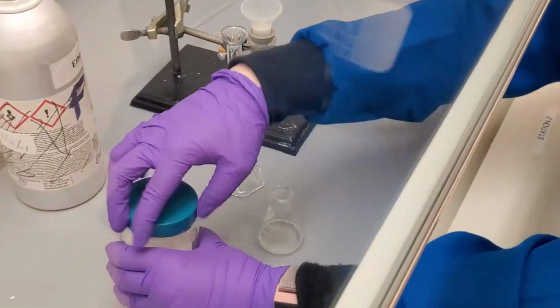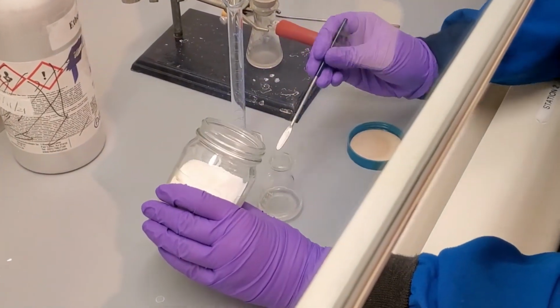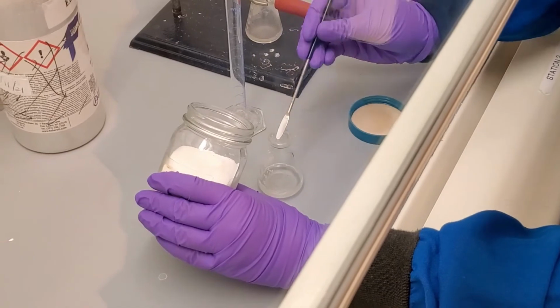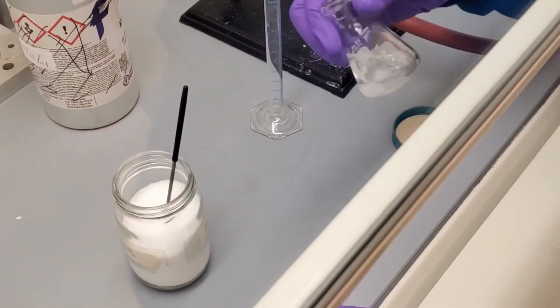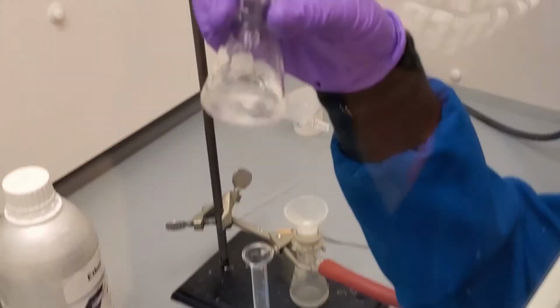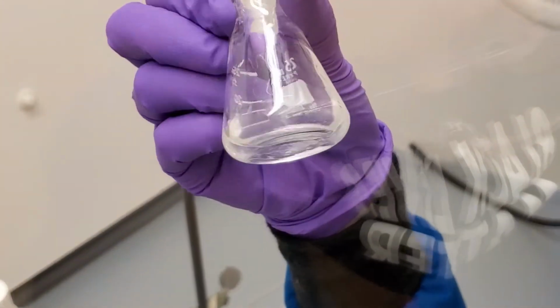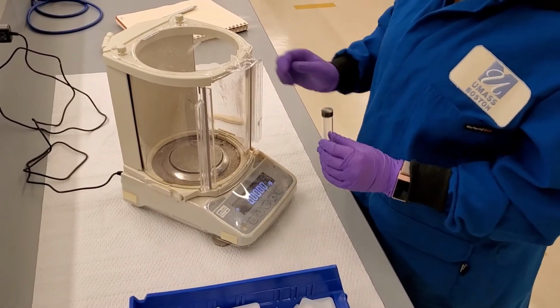Add a few scoops of the drying agent, sodium sulfate, to the flask and swirl. If the sodium sulfate is clumping, add more and swirl until you see free-flowing sodium sulfate crystals. Cover the Erlenmeyer flask with a piece of parafilm so the diethyl ether does not evaporate.